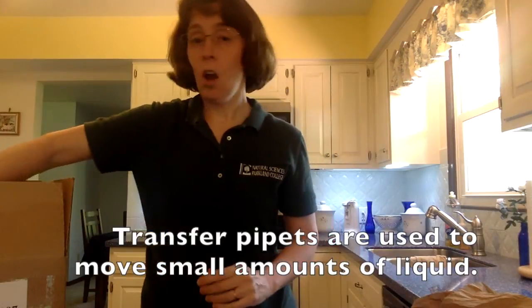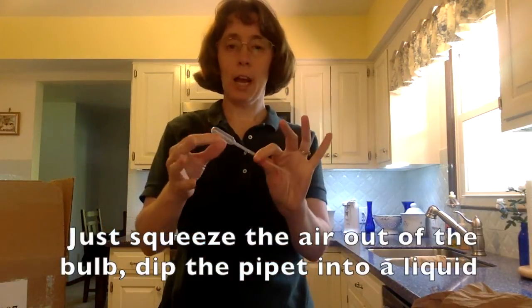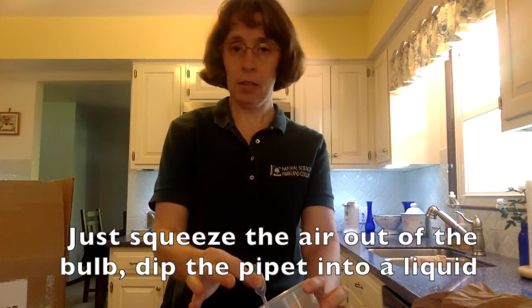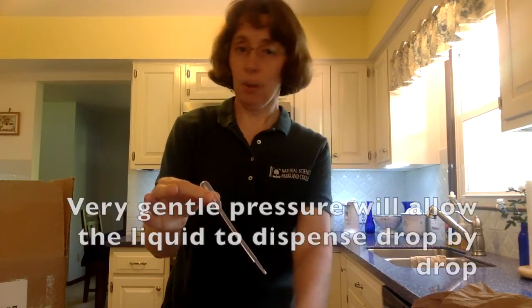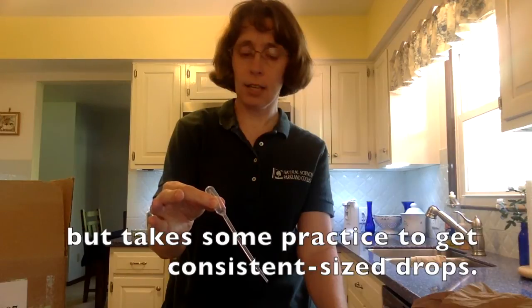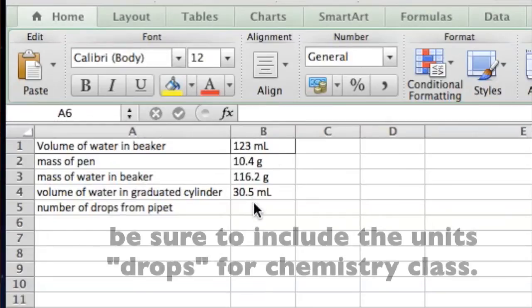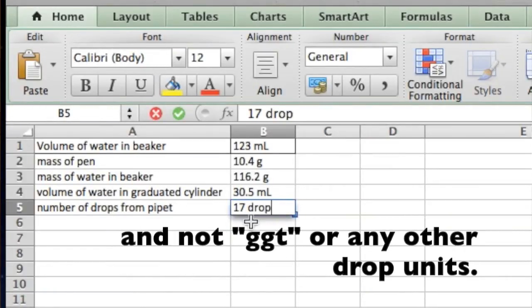Transfer pipettes are used to move small amounts of liquid. Just squeeze the air out of the bulb, dip the pipette into a liquid, and then release the bulb to draw up the liquid. Very gentle pressure will allow the liquid to dispense drop by drop, but take some practice to get consistent size drops. When counting drops for a lab report, be sure to include the units drops for chemistry class, and not GGT or any other drop units.